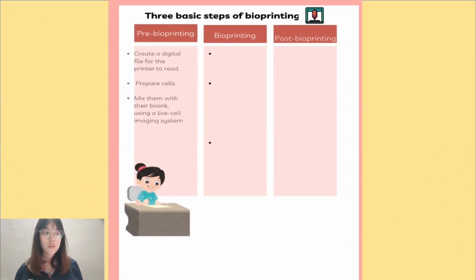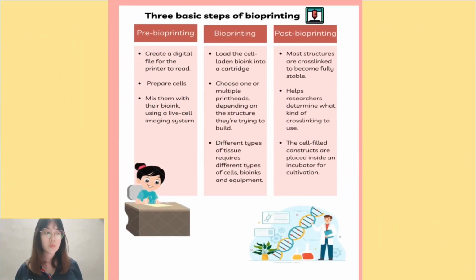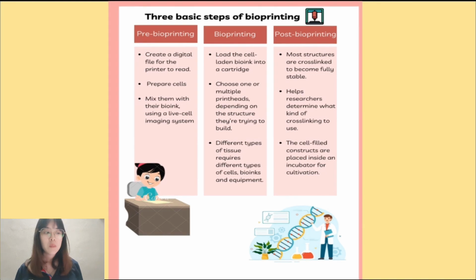There is also a set of procedures to perform bioprinting, and basically it involves three general steps, which are pre-bioprinting, bioprinting, and post-bioprinting. Pre-bioprinting requires creating a digital file for the printer to read. Today, these files are often based on CT and MRI scans. Researchers prepare cells and mix them with their bioink using live cell imaging systems.